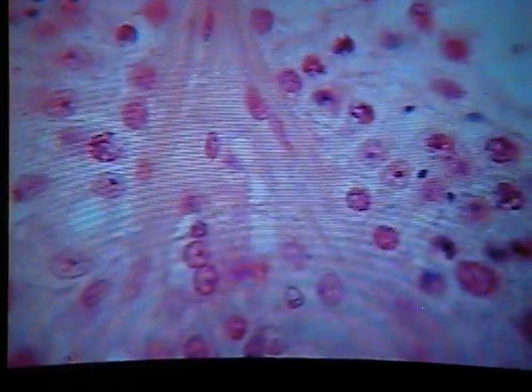Chromosome count? 2N. No. You told me this is 2N. 1N. Make up your mind, guys. Try again.